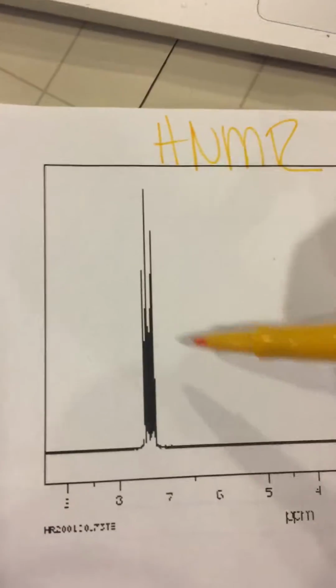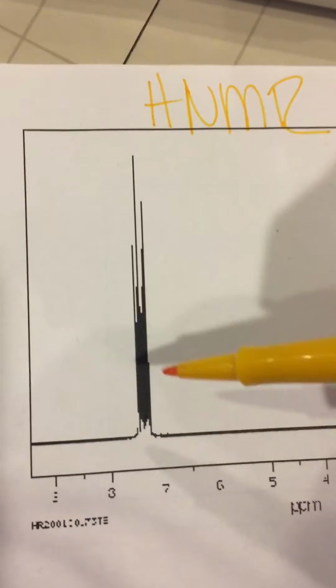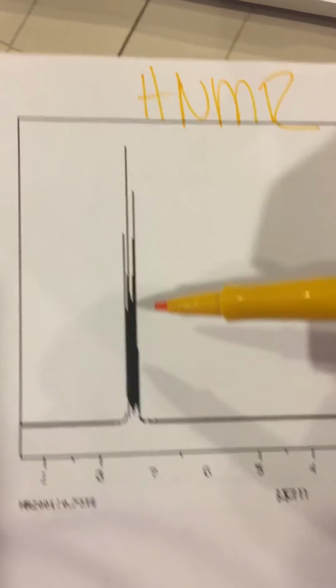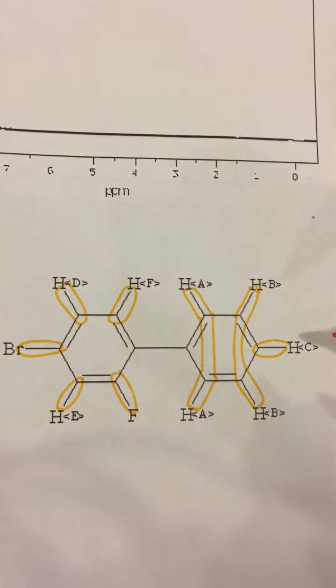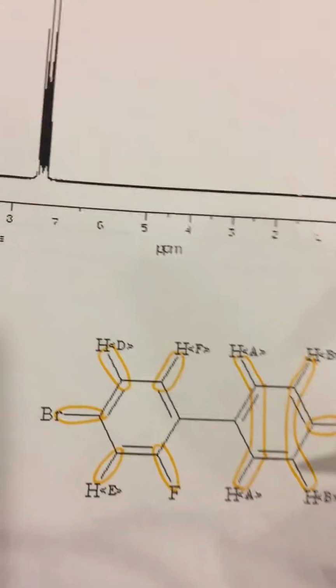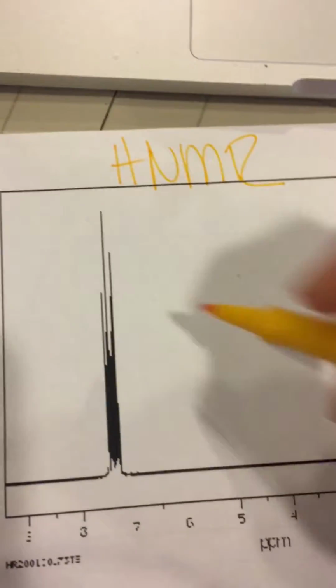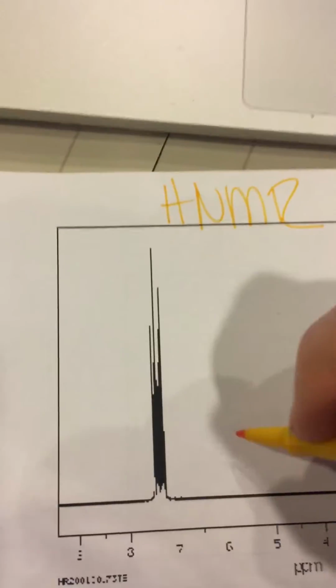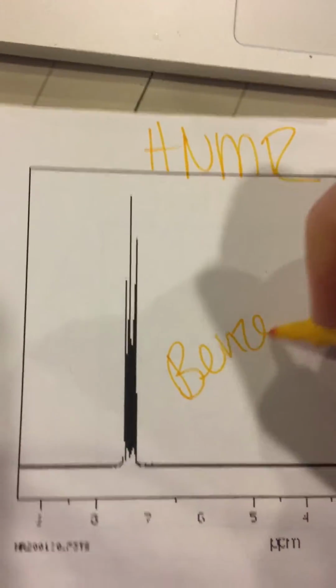Alright, when doing hydrogen NMR, we're going to be looking at a diagram like this, and from this you can see that there's tons of points, or peaks, and they're all grouped together. And we know that our molecule looks something like this, and that it clearly has two benzenes. With the diagram being so clustered together, we can basically sum this up as one benzene or multiple benzenes.